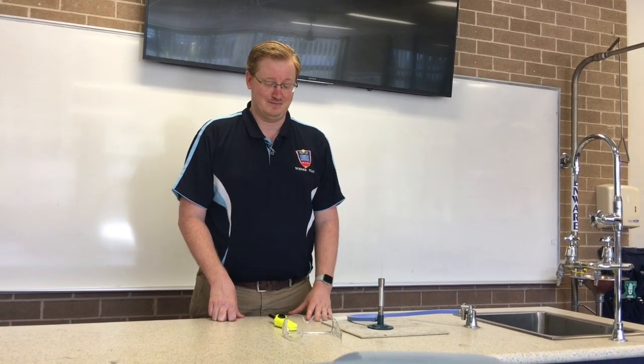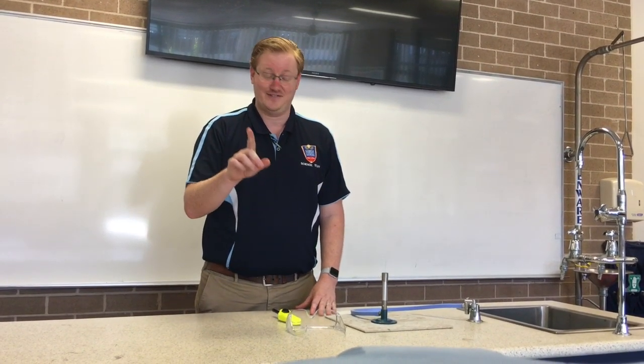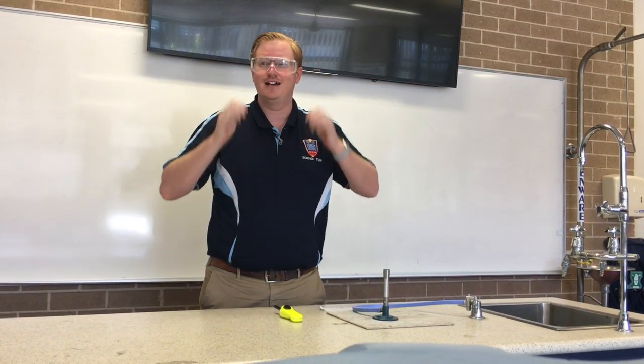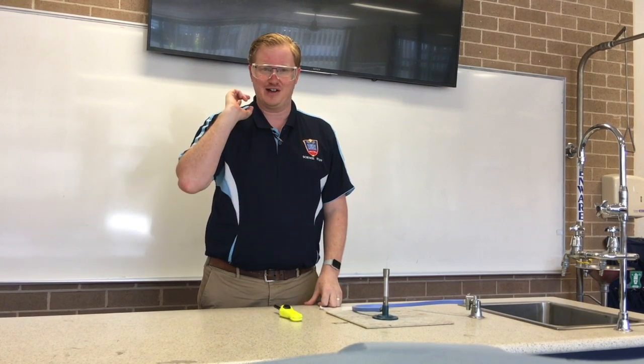Today I'm going to show you how to light a Bunsen burner. First, safety. I'm going to put on my safety glasses over the top of my glasses, and if you have long hair you're going to have to tie it back.